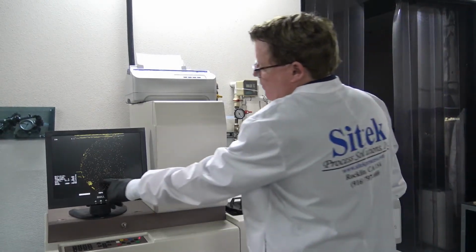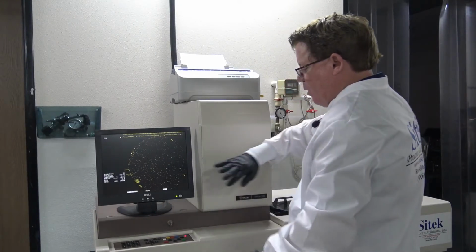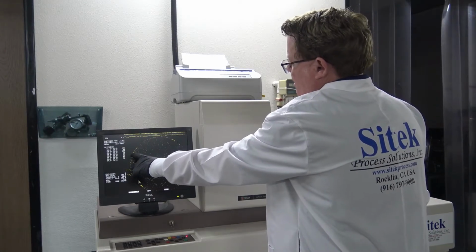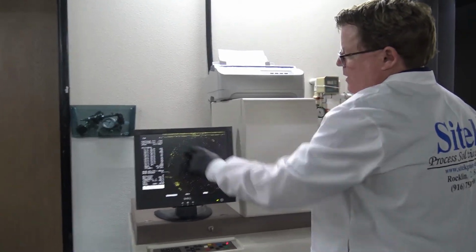Okay, you can see there's our old fingerprint. As you notice, it continually moves around. As the wafer orients back, it turns a little bit each time. We started at about 11 o'clock, then 9 o'clock, now 7 o'clock. Okay, as you saw, as I expected, now we're at 1342.